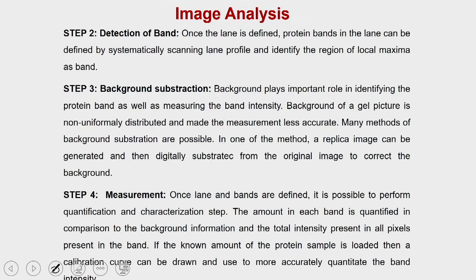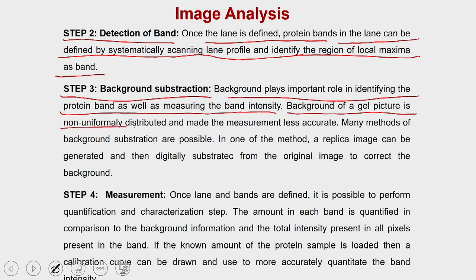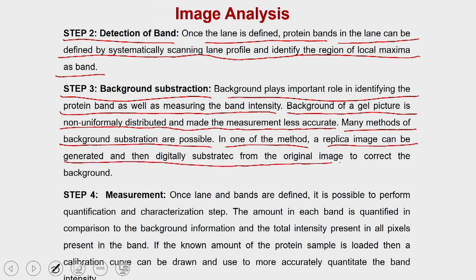Once you have selected the lane, then you have the detection of the band. When the lane is defined, the protein bands in the lane can be defined by systematically scanning the lane profile and identifying the regions of local maxima as bands. Then in step 3, you have the background subtraction. The background plays an important role in identifying the protein band as well as measuring the band intensity. The background of a gel is non-uniformly distributed and makes the measurement less accurate. Many methods of background subtraction are possible. In one method, a replica image can be generated and then digitally subtracted from the original image to correct the background.